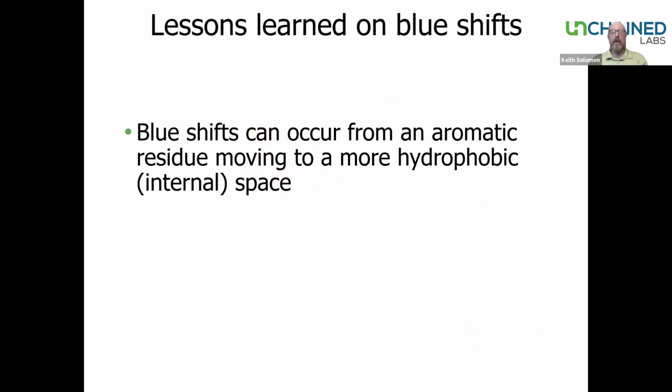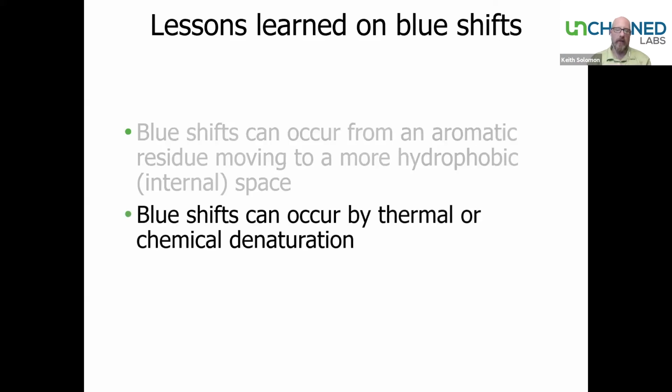So what have we learned about blue shifts? Blue shifts can occur from an aromatic residue moving from a more hydrophilic to a more hydrophobic space, whether that is a solvent exposed tryptophan moving to an internal space, or even a buried tryptophan moving to a more hydrophobic space. Both of those can result in blue shifts.